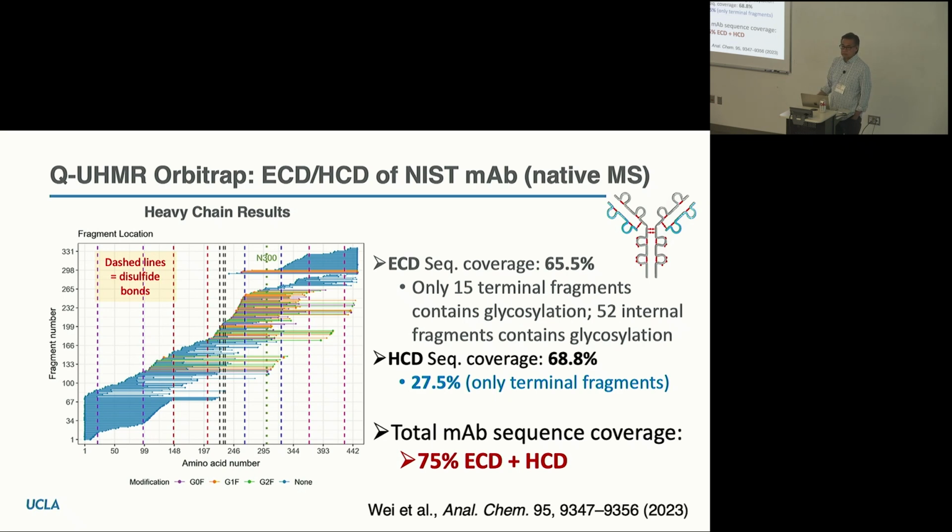Yep. Is native MS possible with MALDI? If you read the early papers of MALDI, especially by Franz Hillenkamp, they were showing some of the same enzymes and proteins that I was showing, and they were showing aggregates or the right sizes of some of these complexes. And I normally would have thought that the matrices that Rachel showed that were useful in MALDI are very acidic, and so I would think that would have disrupted the interactions. Plus, when the laser hits it, there's a lot of energy going on. I would think that would disrupt it.